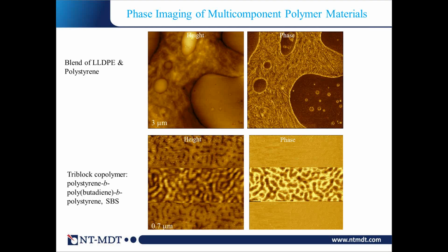Nowadays people usually make materials from multi-component systems. They are mixing polymers with some inorganic fillers and so on. So people want to see the compositional map of the material, to see how one component is distributed in the other, because this finally reflects the properties of the material. That's what many manufacturers try to achieve, to improve mixing and to specify morphology for a particular practical task.